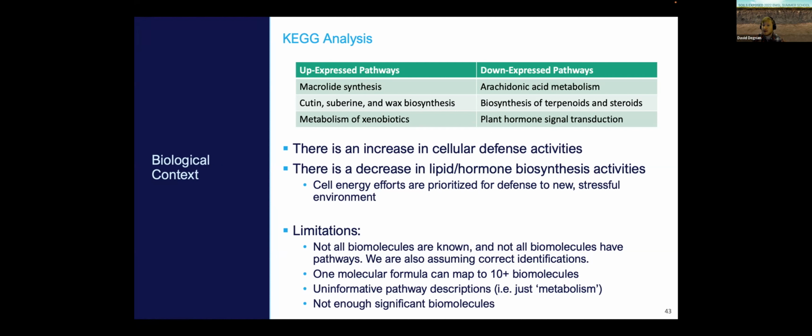So now that we've answered our question, that we know that they're stressed, what is happening on that level and what kind of omics do I want to do from here from FTMS? Maybe I do want to do metabolomics at this point, more targeted towards these areas like GCMS or LCMS, or maybe this is lipidomics here. So we answered a question, and we're proposing our next question with the data we had before.